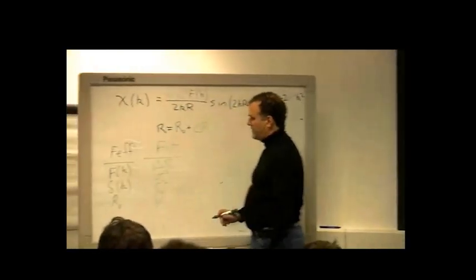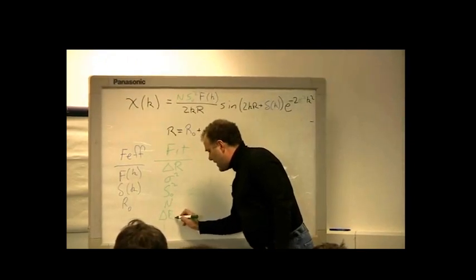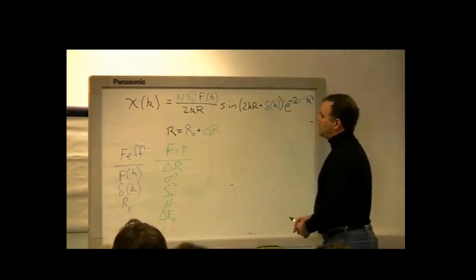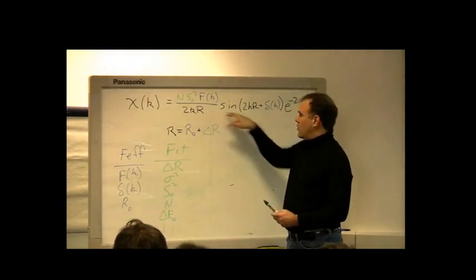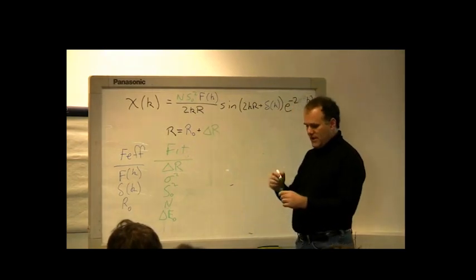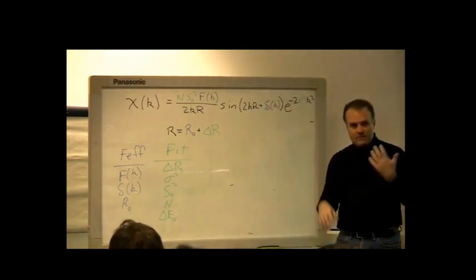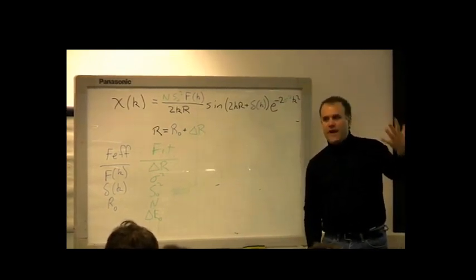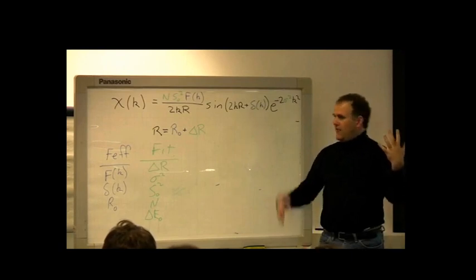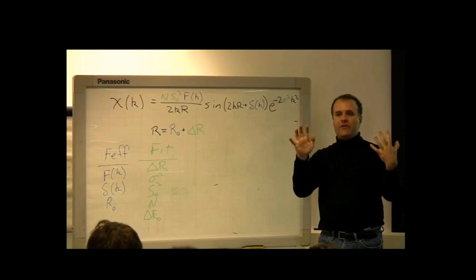And there's another thing that I haven't written down that's an energy shift, a shift to the 0 of k, right? Where k equals 0 might need a shift. And why do you need a shift in the energy? Well, in Athena, you picked some value for E0. That set the 0 of k. In the theory, it picked some value of E0 and set the 0 of k, but they're not necessarily the same choice.